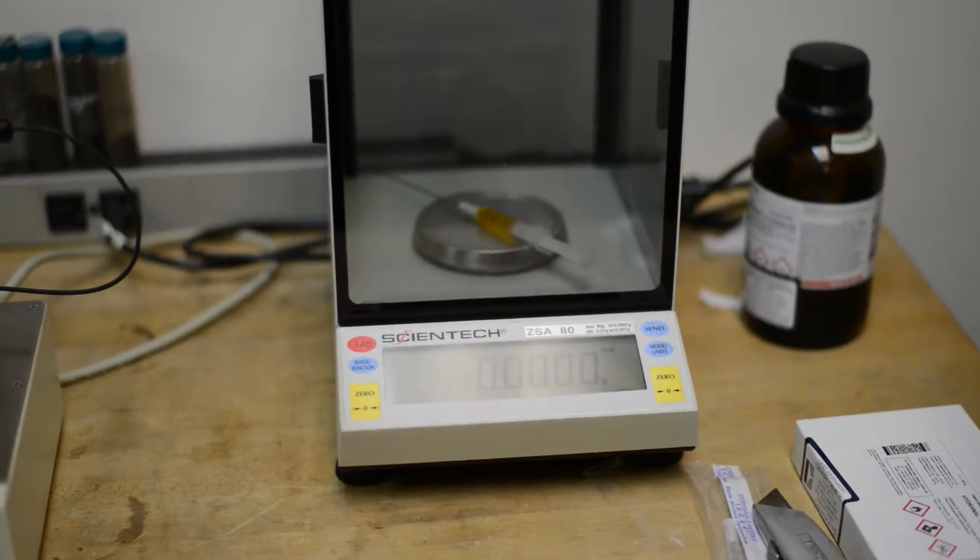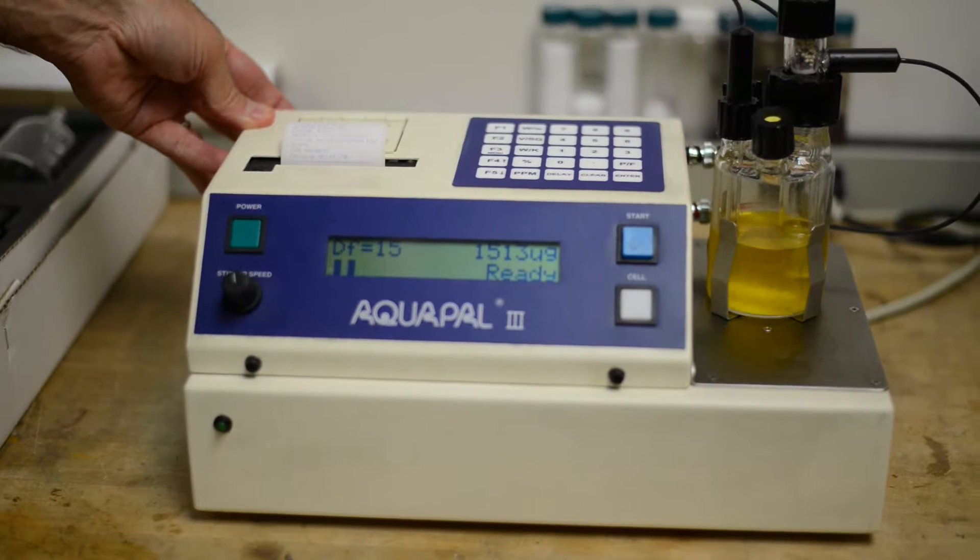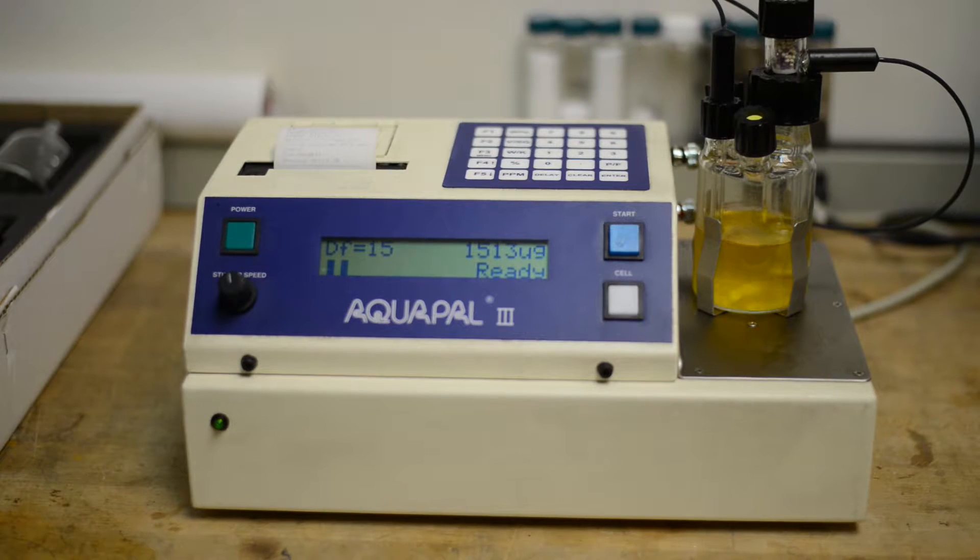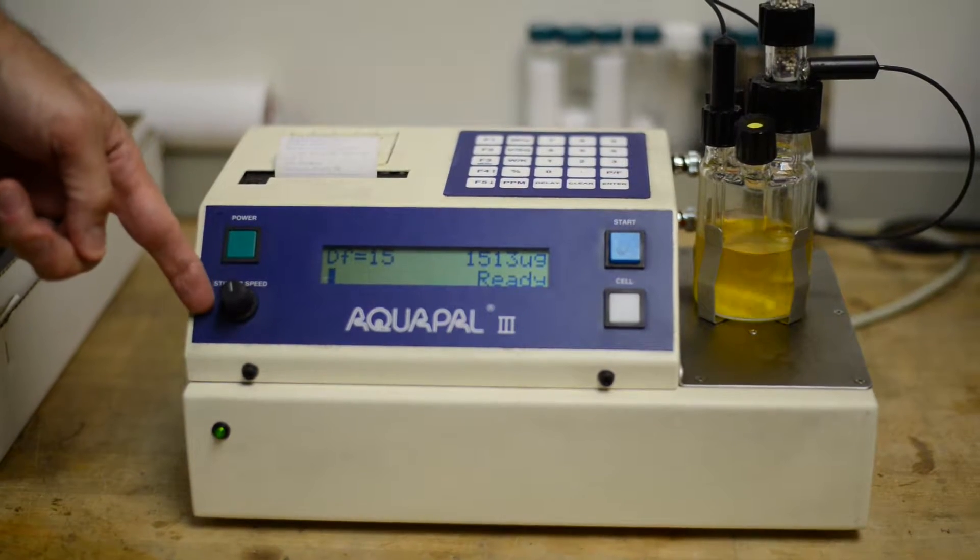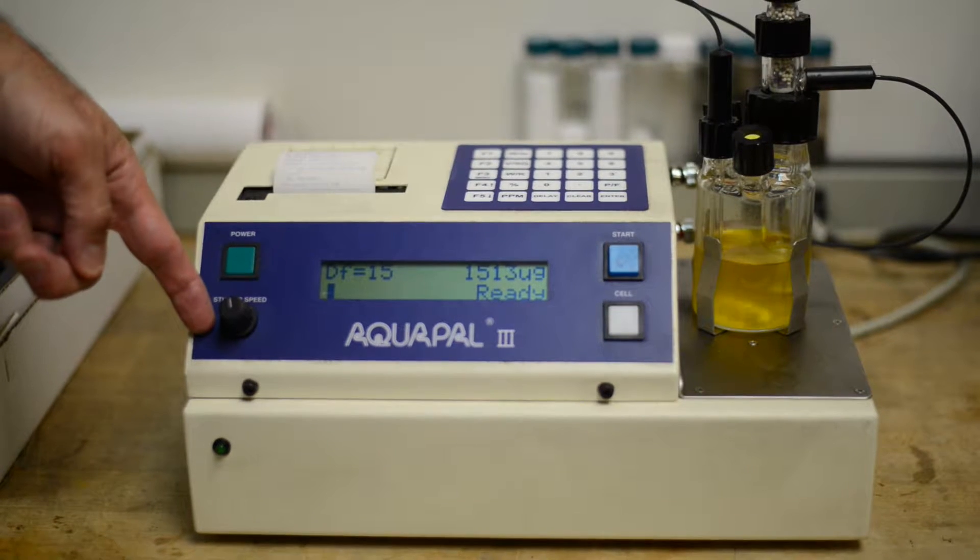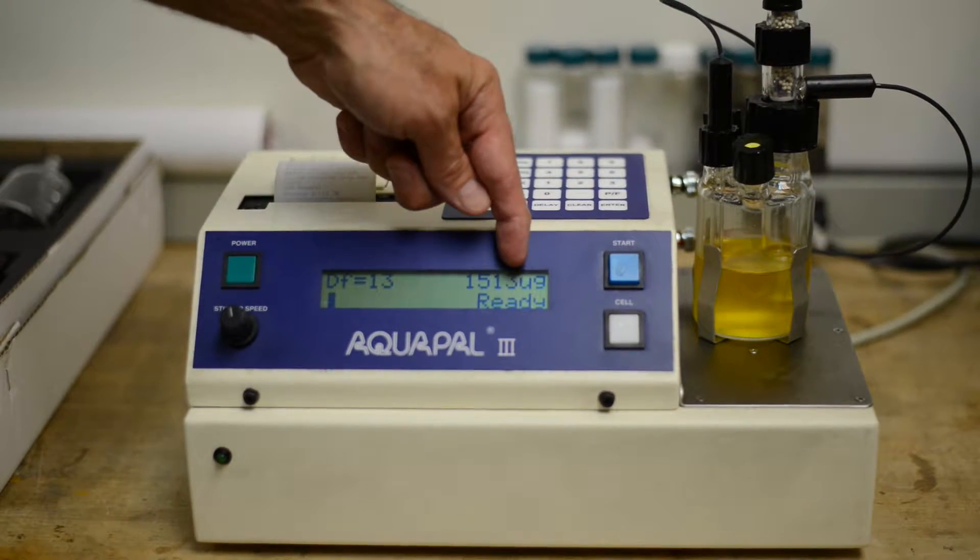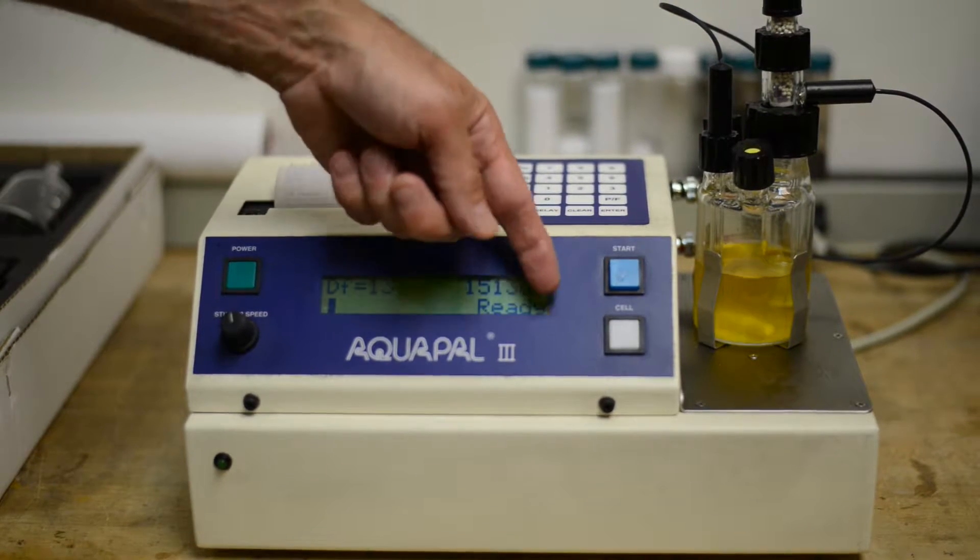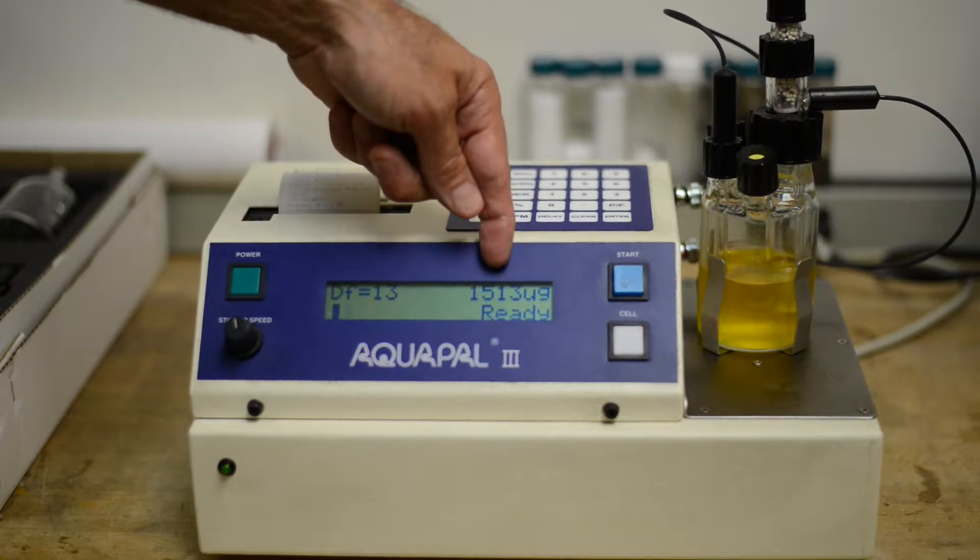So here we have the Aquapel 3. It's set up, right now it's running a dual reagent. This is a coulometric Carl Fischer titrator. It has a power button, it has a stir bar speed dial. It's got the readout, it gives us our drift, it gives us our counting moisture in micrograms, and it gives us our ready mode. We have our cell button, which we turn on when we want the pretitration to begin. And then, of course, we have our start button for starting the test.